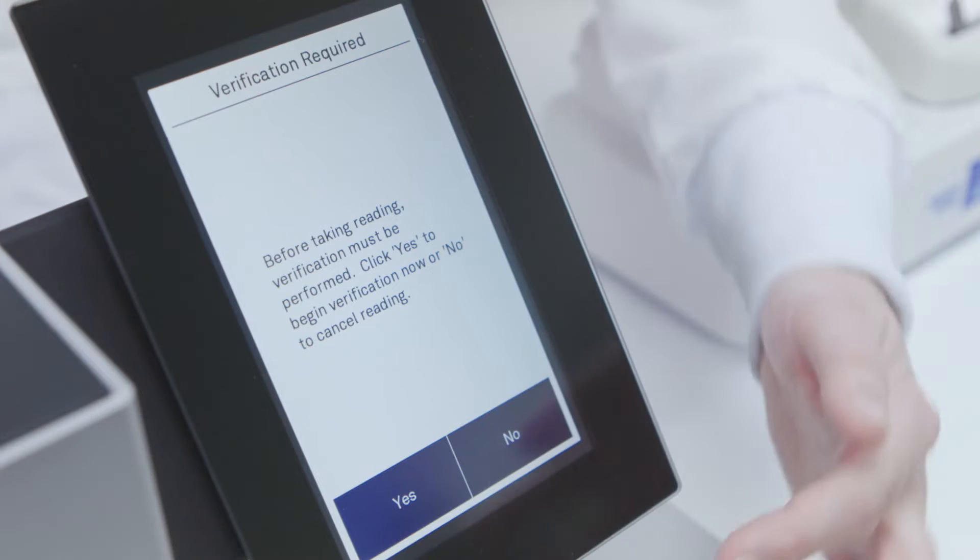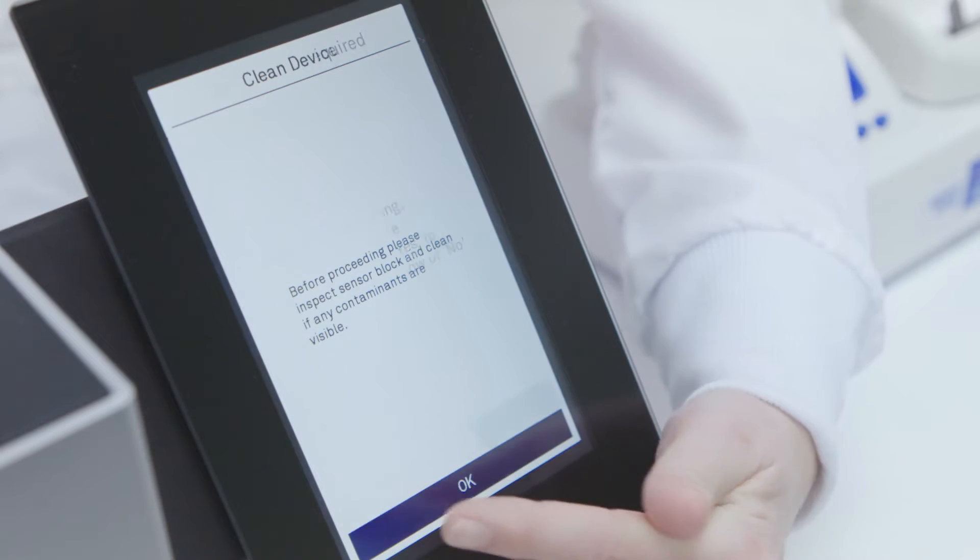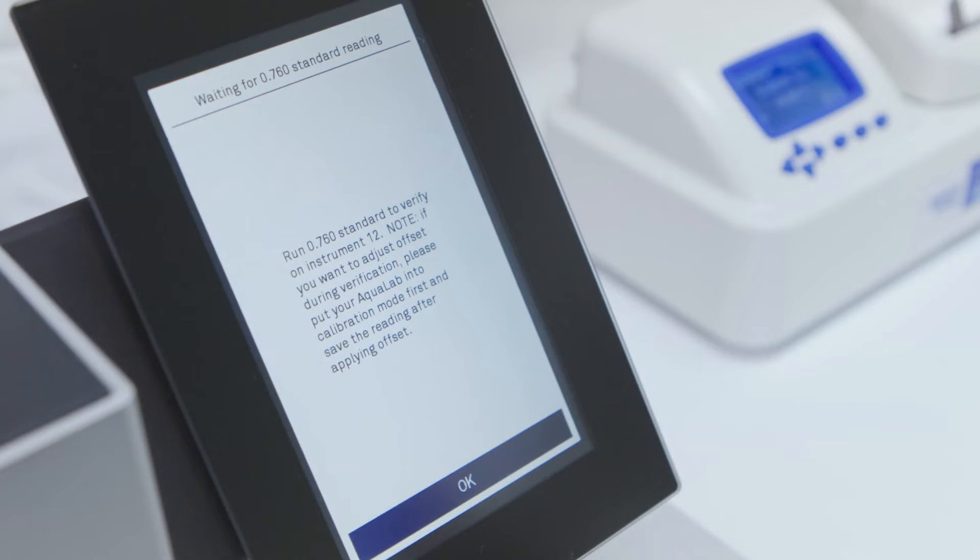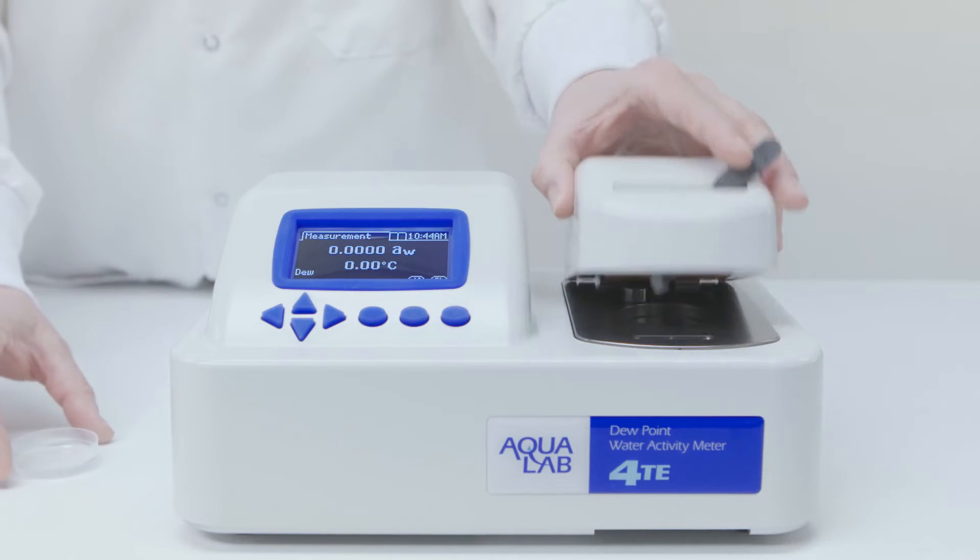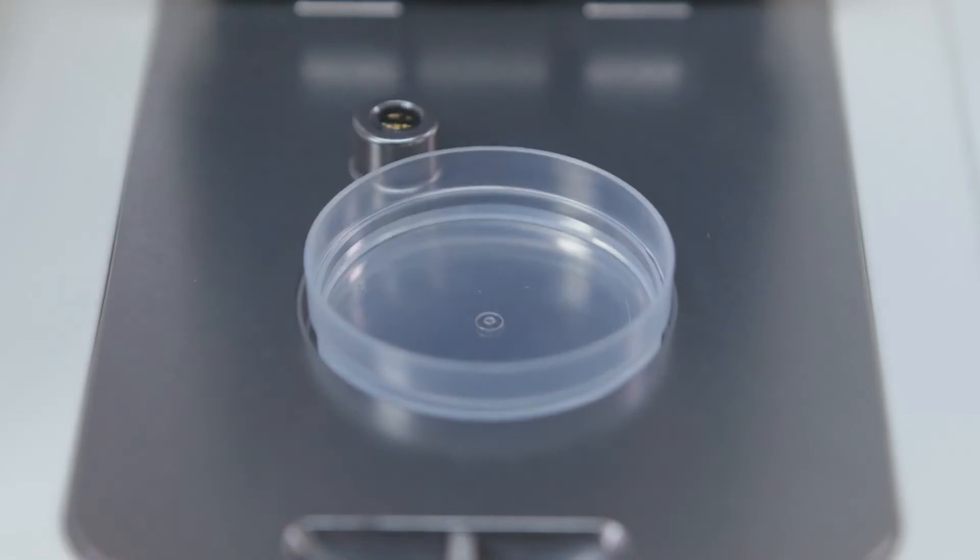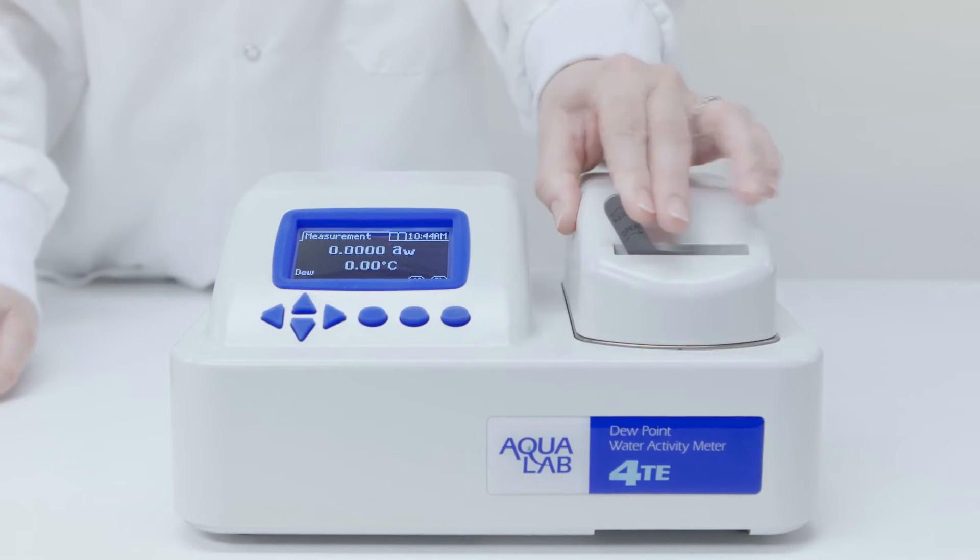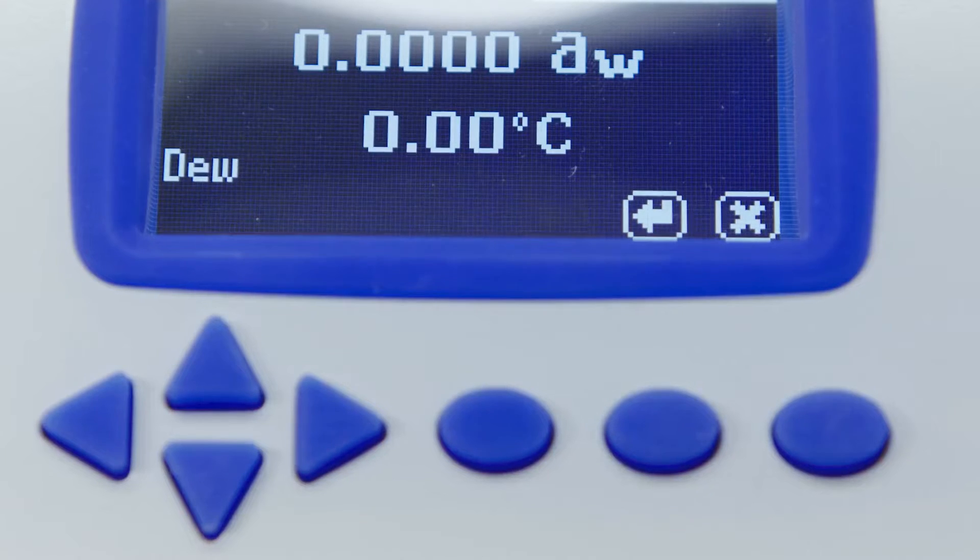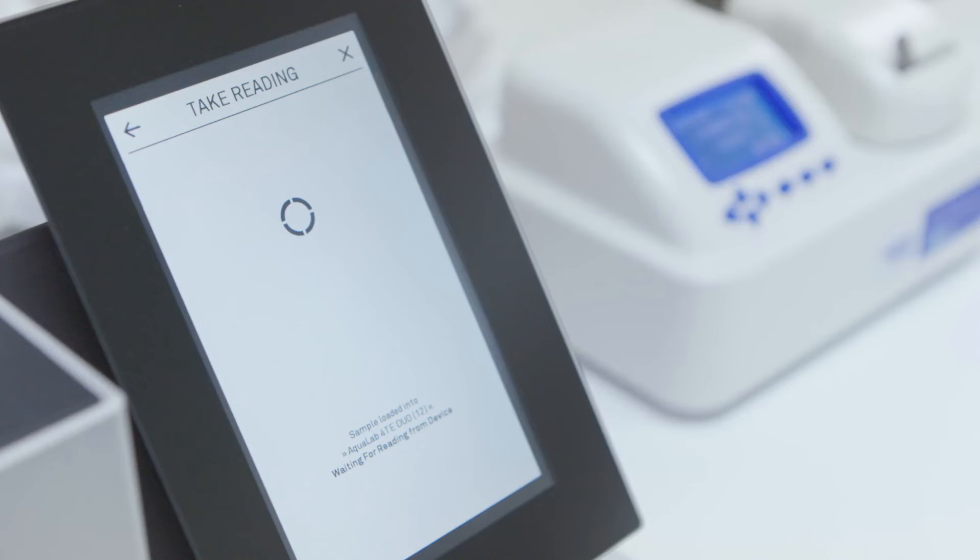The safety and quality of your product depends on its water activity reading, and the quality of your water activity reading depends on the performance of your water activity instrument. Fortunately, you can use salt solutions with a known water activity to verify that your instrument is performing correctly. Often these verifications need to be documented, and auditors and inspectors will expect to see these values.